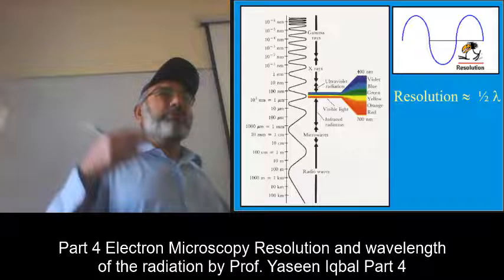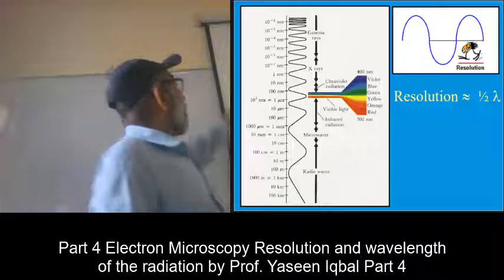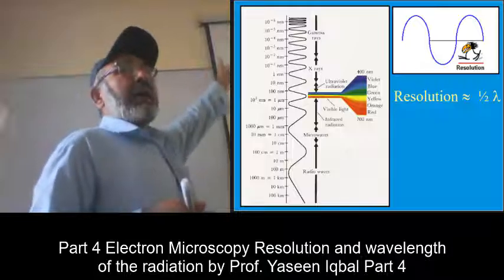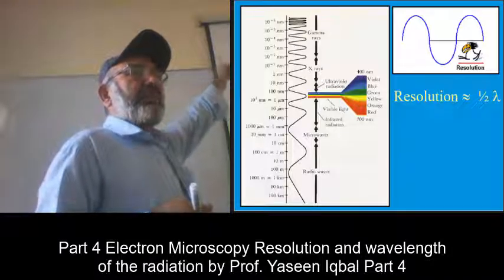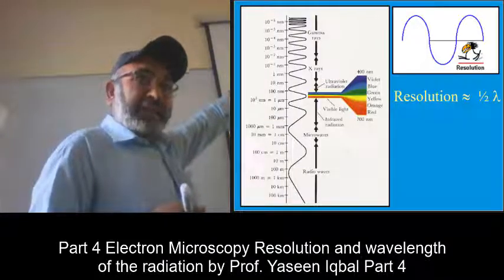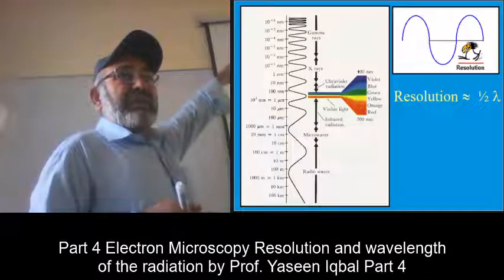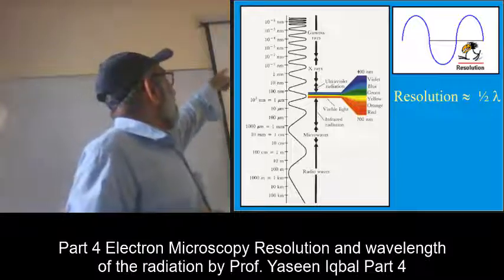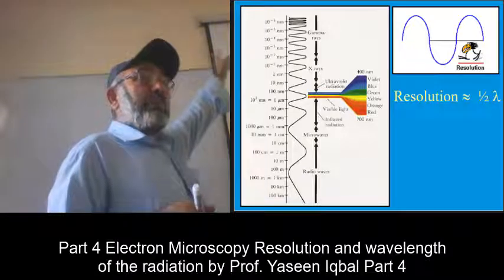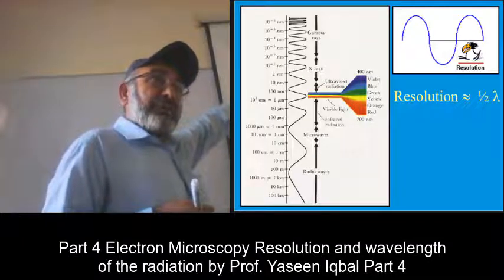People who know, they know what they are reading and what they are assessing, right? So, 10 angstrom over 100 means 1 angstrom over 10, so 0.1 angstrom up to 10 power minus 6 means divided by 10, so multiply it by 10, so it will be 10 power minus 5 angstroms.